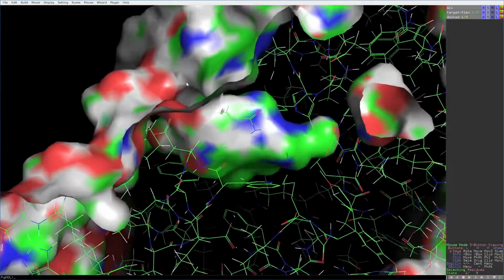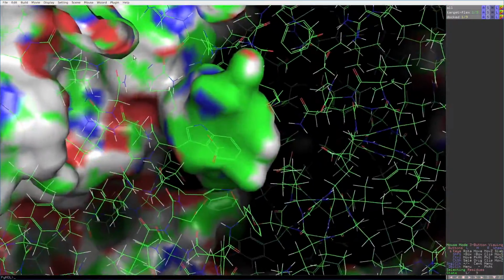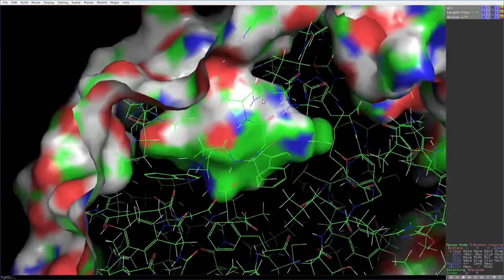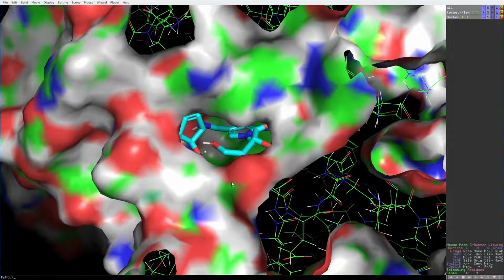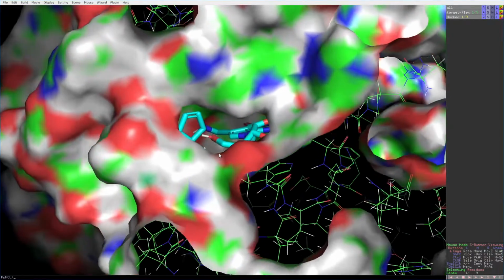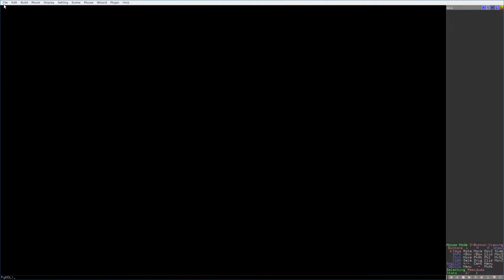It looks pretty good. There's like space in there. But you don't have anything, everything is unknown. I don't know, that one looks pretty good to me. That's just everything, and let's just make sure.